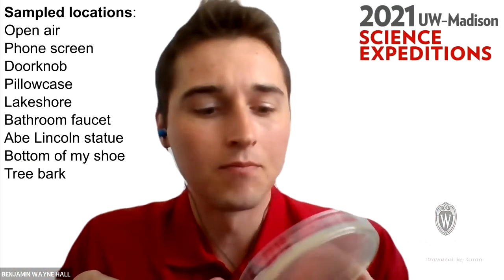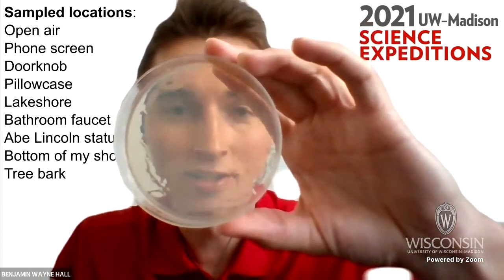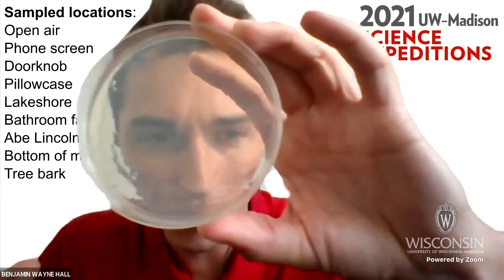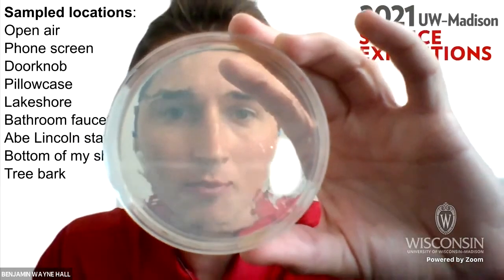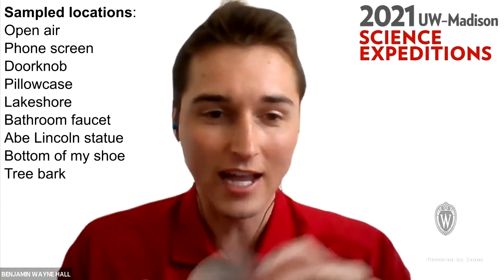So this was surprising to me, and based on the explanations you guys gave, I touch my phone screen all the time. So only seeing a couple was pretty surprising, and they're very small. But we'll talk about what reasons for this might be. So that's the phone screen.